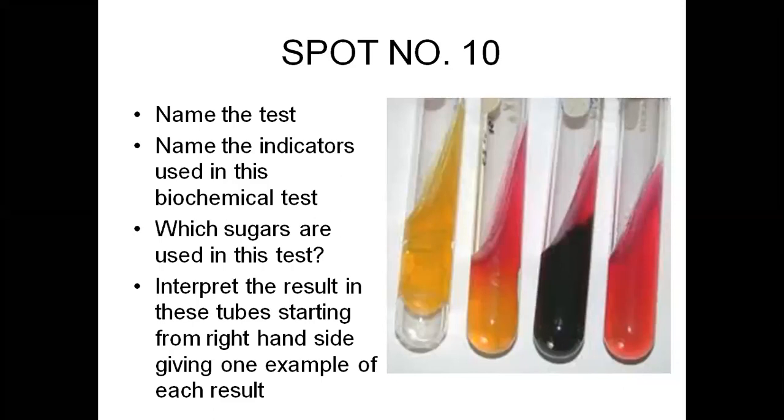Lactose fermenters remain the same as on MacConkey's agar, that are E. coli and Klebsiella. Pseudomonas, Proteus, Shigella, Salmonella are non-lactose fermenters.